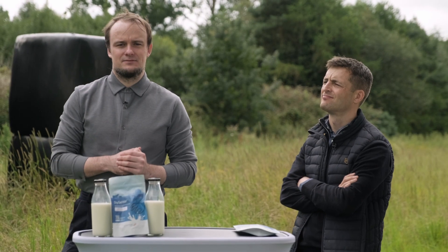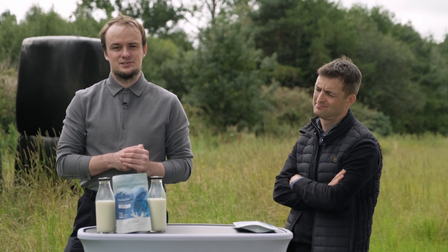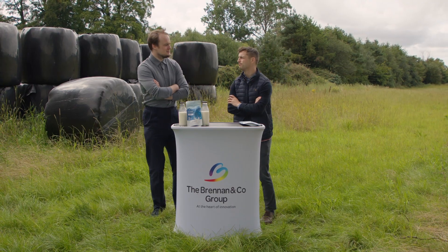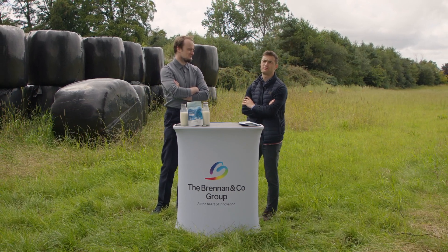Better testing practices at farm level can help dairy farmers avoid penalties and increases in their insurance premiums. Aaron, you're the product specialist so I'll leave the steps to you. Thanks Luke, now we're gonna go through the steps involved.